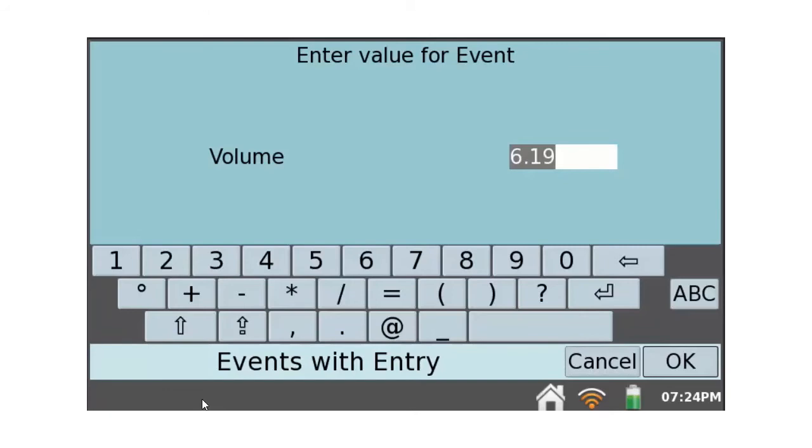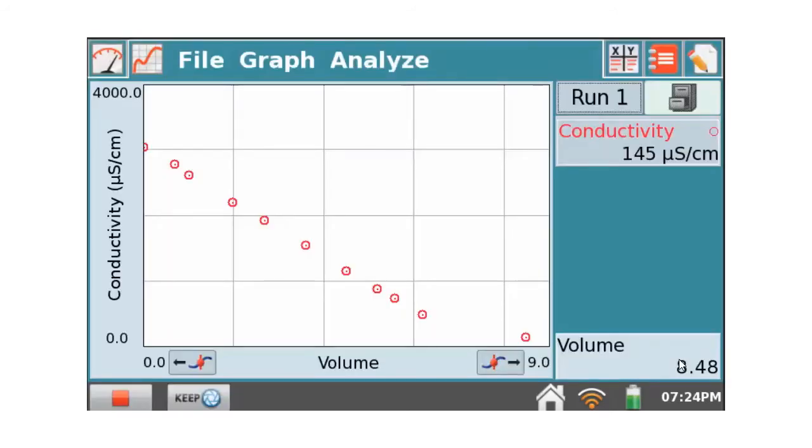We just do that because I kind of like doing that. Then here you type in whatever volume corresponds to that particular addition. In this case it was 8.48 milliliters. Type that, hit the okay down below, and now you've got that piece of data in. You can do this for several data points along the way.